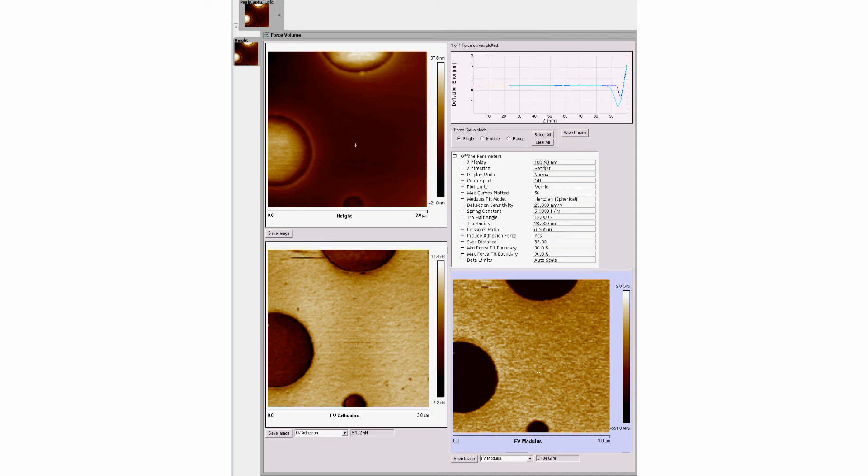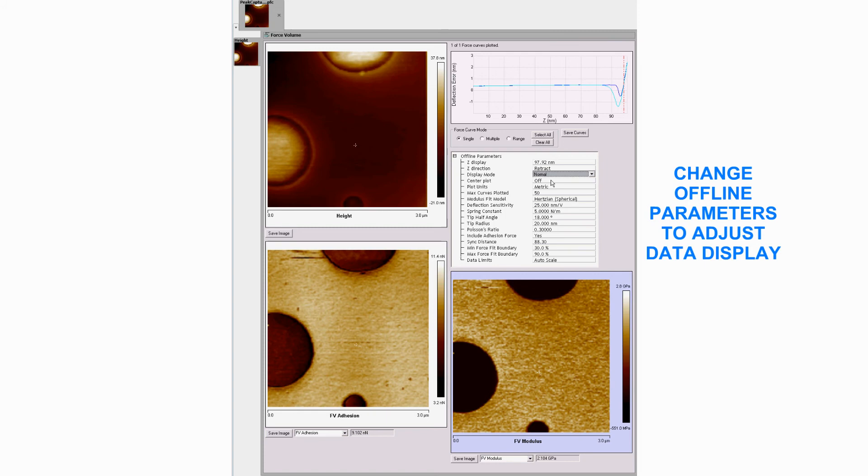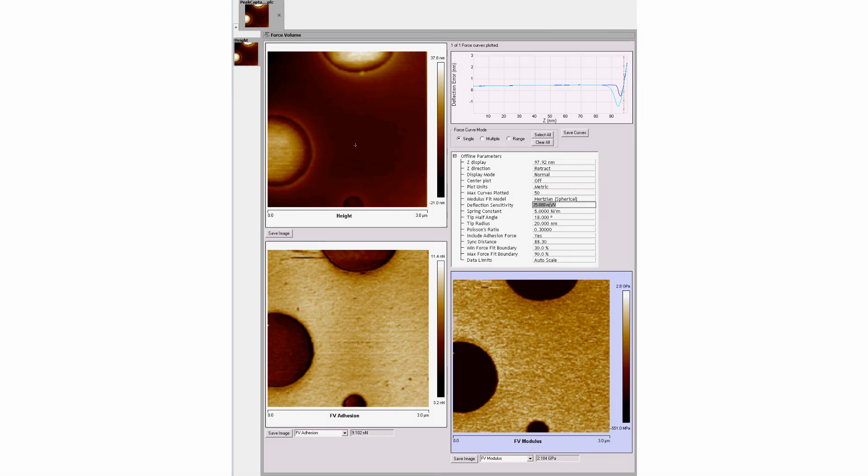The offline parameters list allows the user to select between separation or deflection display modes, to align the display curves to a common reference point, and to enter values for deflection sensitivity, spring constant, or other parameters as required by the modulus model being used.